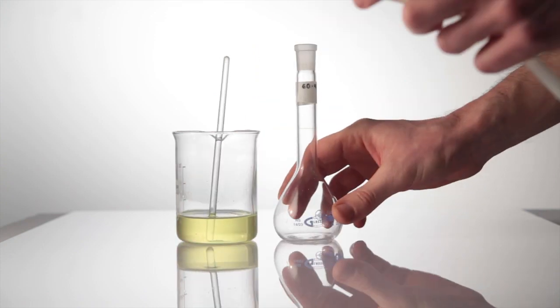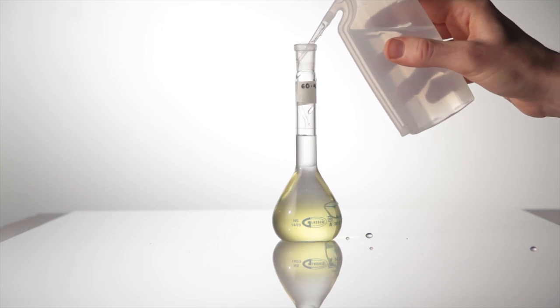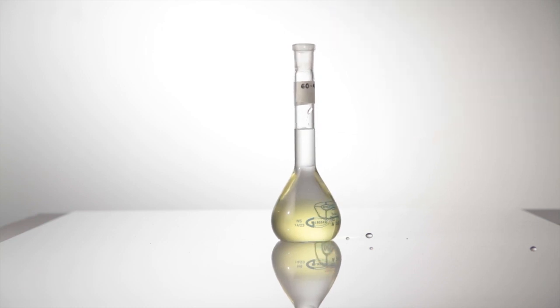Transfer the solution to the volumetric flask and rinse the beaker, funnel and stirring rod a couple of times to ensure that all of the solute is now in the volumetric flask. Top up with deionized water to the line before recording the mass of the flask once more. And don't forget to invert it a few times to thoroughly mix.